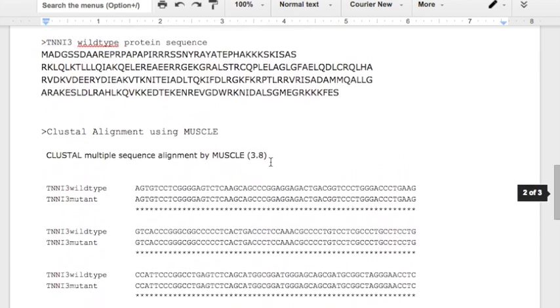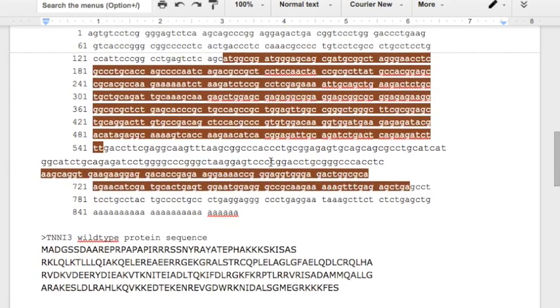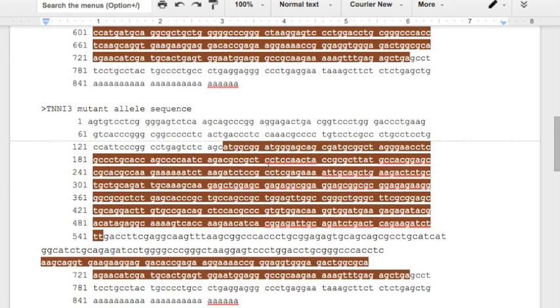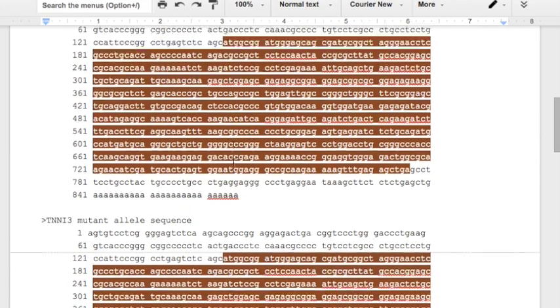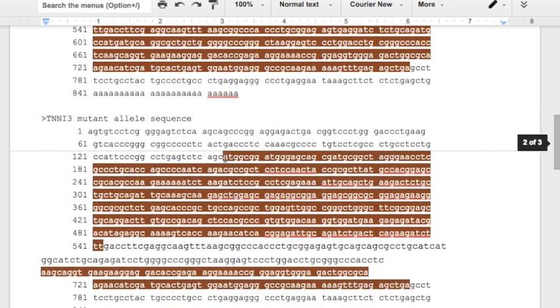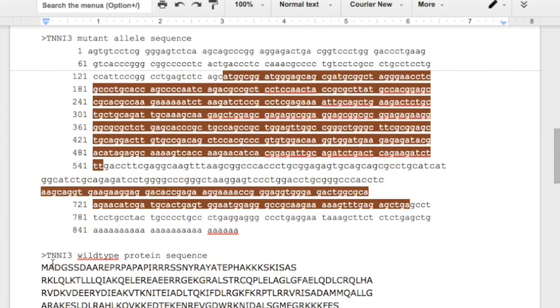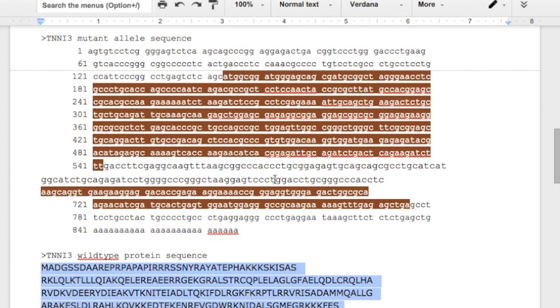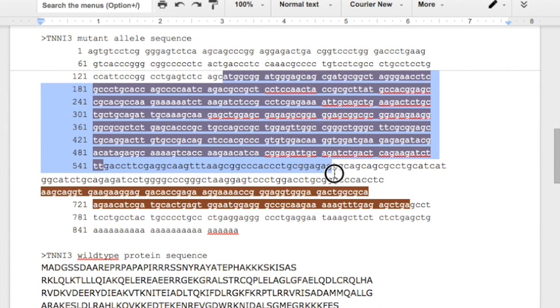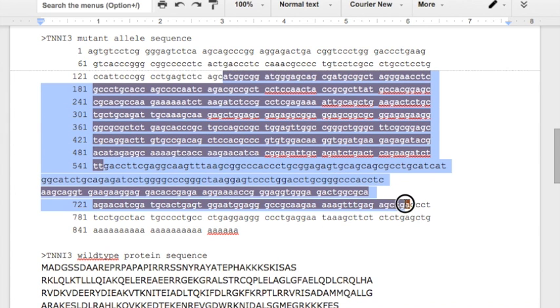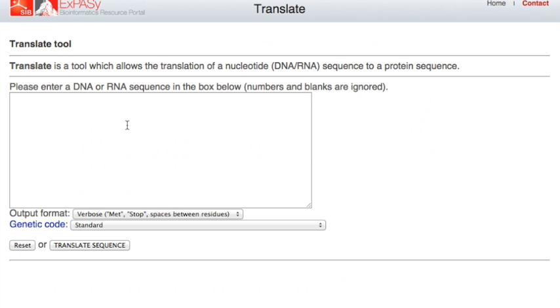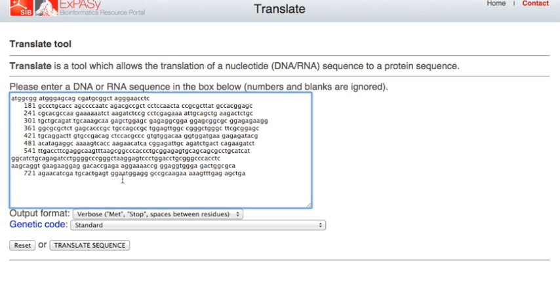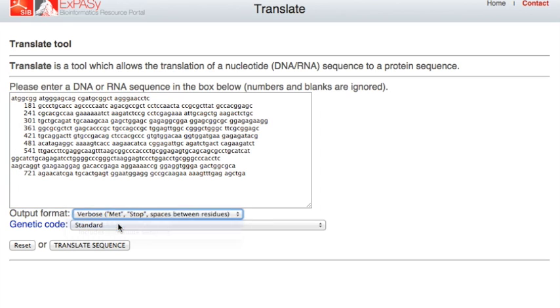Okay, next, let's figure out what it did to the protein. Well, the coding sequence is right in here, in the wild type, but here in the mutant. We know what the wild type protein sequence should be, and here it is. But let's see what would happen if we took this as the mutant allele sequence. If I copy this, paste it into a translate tool, and here is one. I'm going to choose compact on the output format, a little bit easier to interpret. Hit translate, and it will give me the protein sequence.